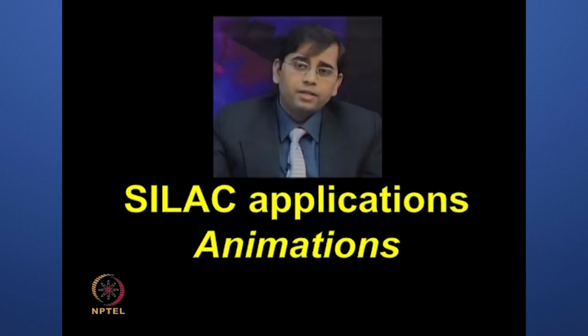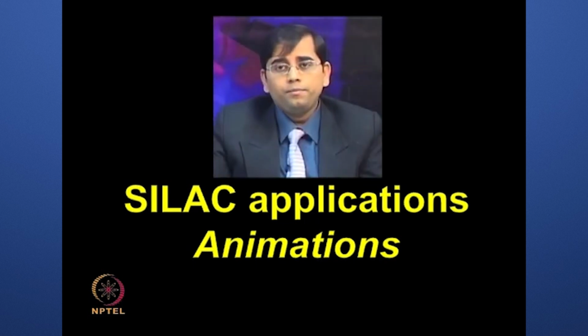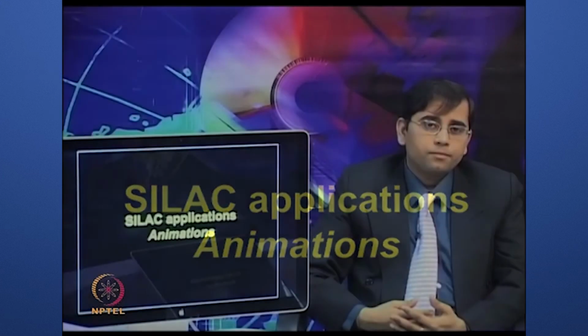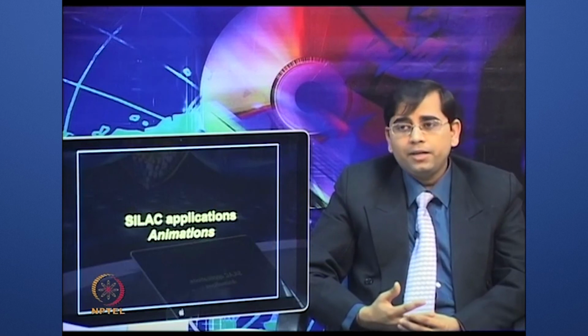So, SILAC applications are straightforward and only require some initial attention to the cell culture conditions. Let us discuss the SILAC applications in an animation.